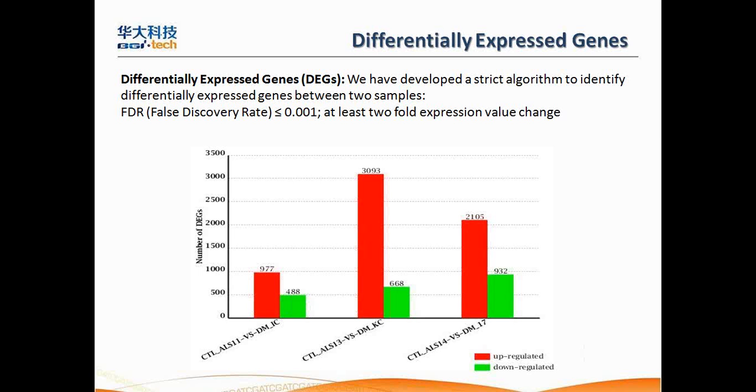And we try to relate this upregulation or downregulation to some specific biological function. So this is why we're interested in differentially expressed genes.